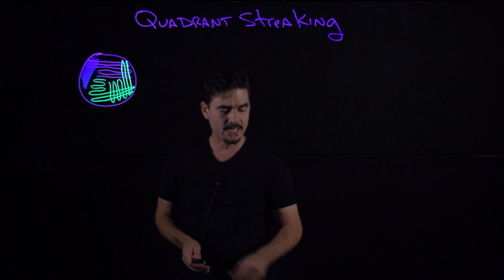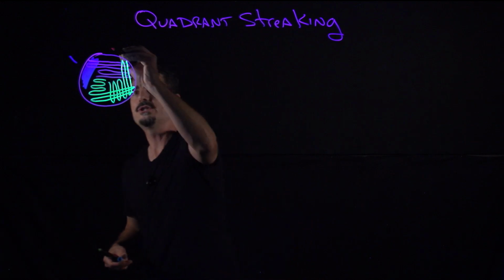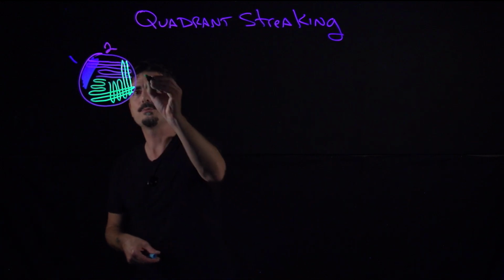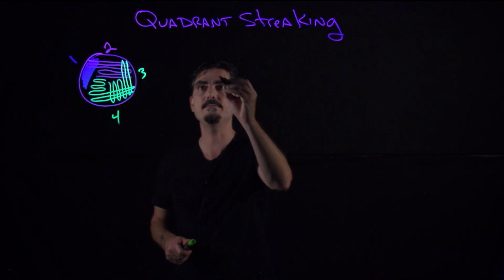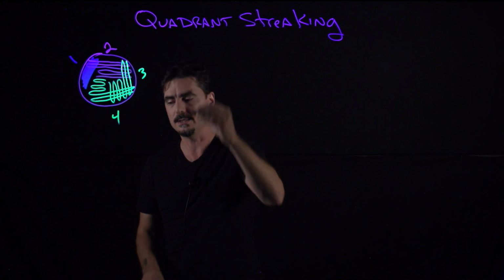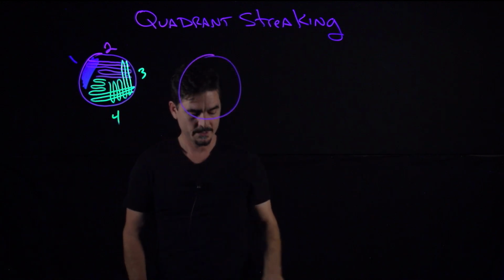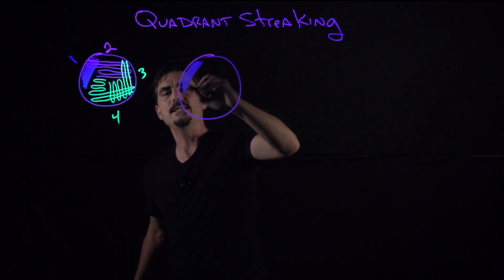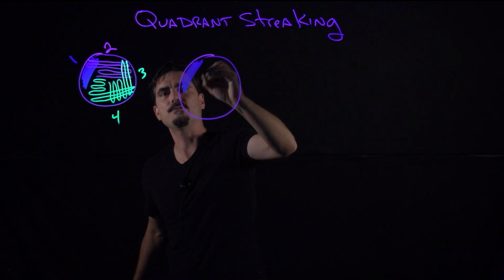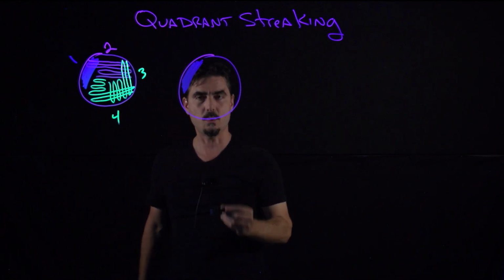So what we have is essentially quadrant 1, quadrant 2, quadrant 3, and quadrant 4. So let's go ahead and do that again, right? Let's keep practicing because you want to make sure that you're really good with this. Okay, so we've got the beginning. We'll start with quadrant 1. Put a lot of bacteria, keep doing it, whatever the sample is, from your nose, from a broth, from the soil, from your phone, whatever the case may be. Okay, so good. So that's quadrant 1.